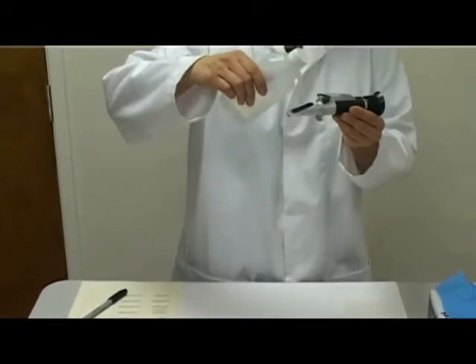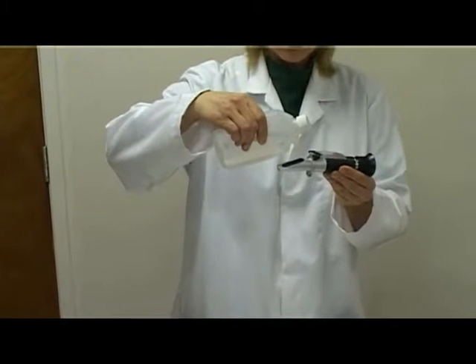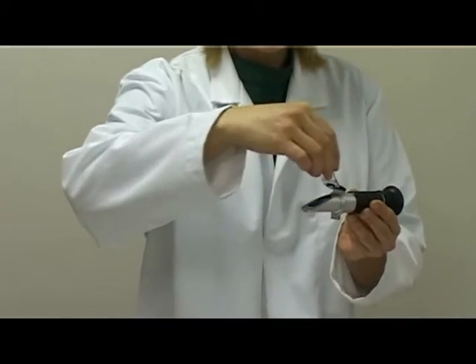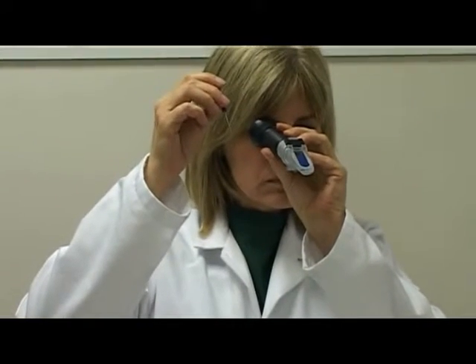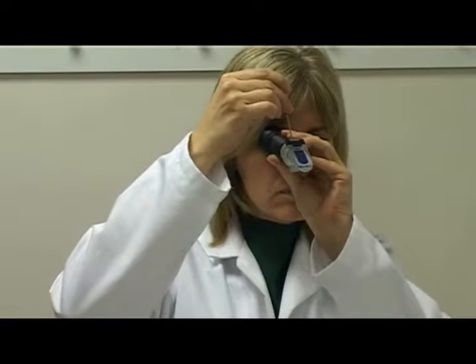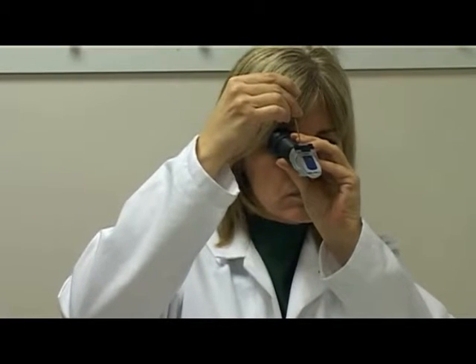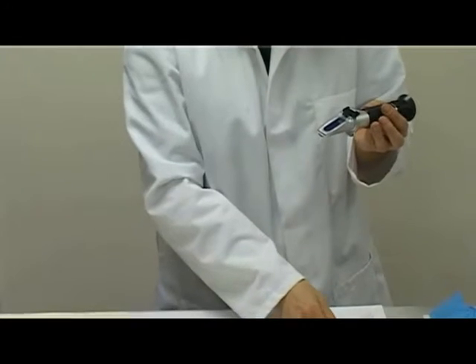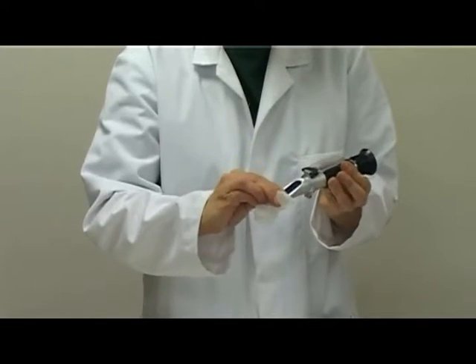Place 2–3 drops of distilled water on the prism surface of the refractometer. Close the cover. Hold the refractometer up to the light source and look down the eyepiece. Using a screwdriver, calibrate the refractometer to 1.000 on the urine specific gravity scale. Lift the cover and dry the prism surface using a dry tissue.